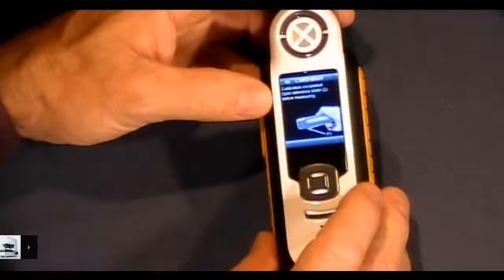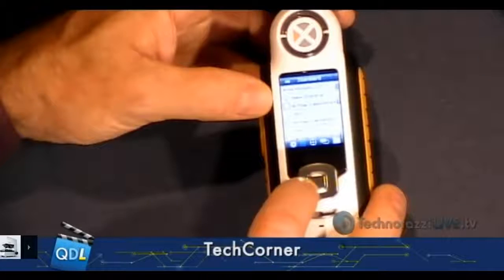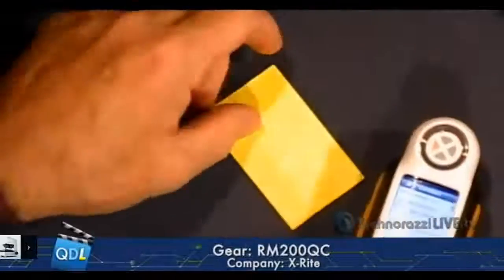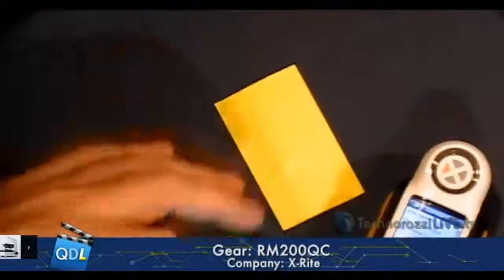Good to go, and we can start taking measurements. Now, what we're going to do first is record our standard. I'm going to create a standard right from scratch and show you how easy it is. I just happen to have a yellow Post-it note, so that is going to be our standard.